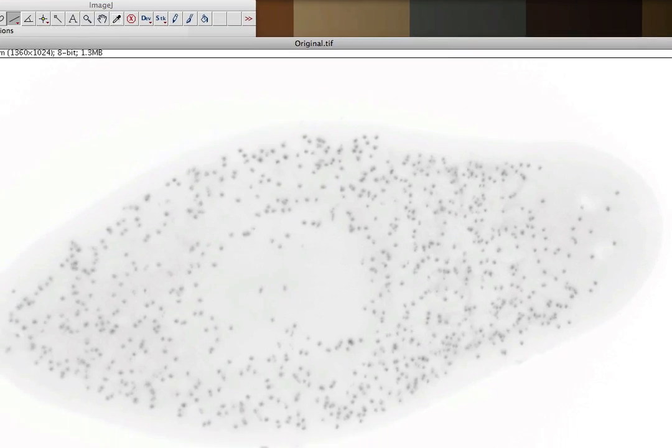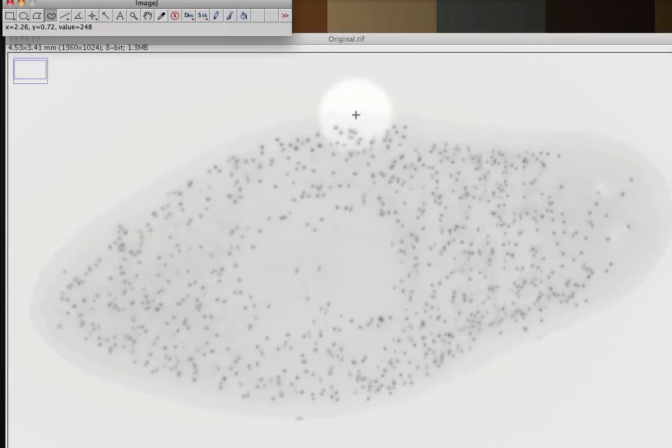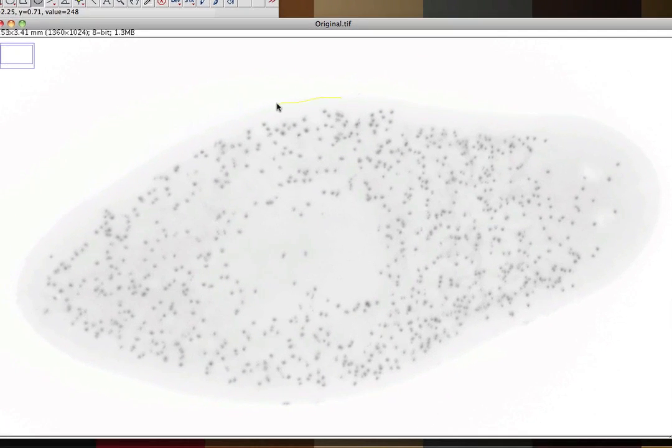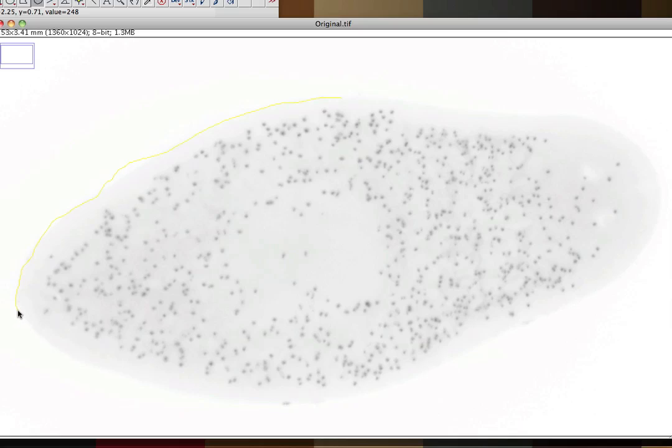Now if I want to know the surface area, I'm going to grab this irregular shaped tool, and then I need to click and drag all around the outline of my specimen. I'm not going to do a perfect job here because I'm going a little fast, but you get the idea. You want to stay as close to the outline of your specimen as possible, going all the way around the edges.